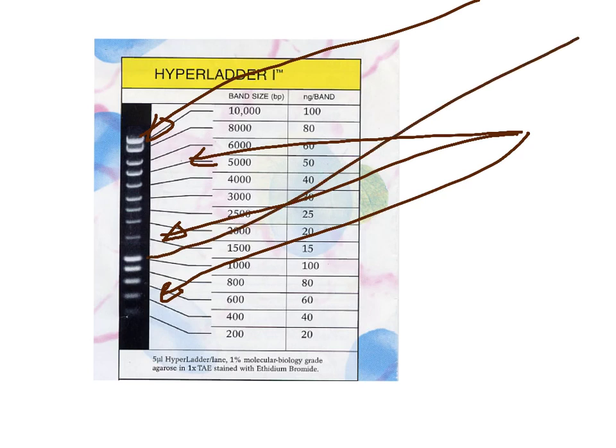And note the 1 and a half thousand base pairs is quite intense. And that's deliberate so that you can see where you are on your gel if some of these bands have electrophoresed on the gel, off the gel, or the gel hasn't been electrophoresed very far.